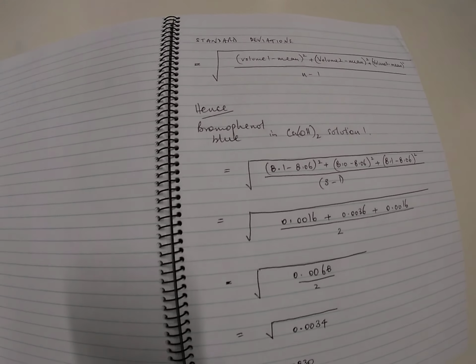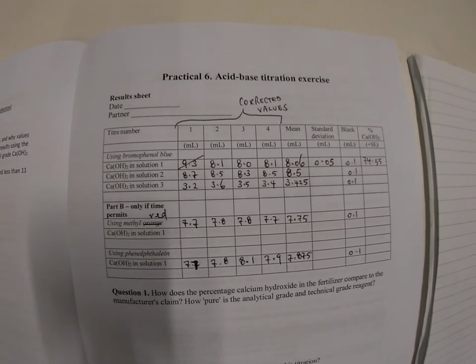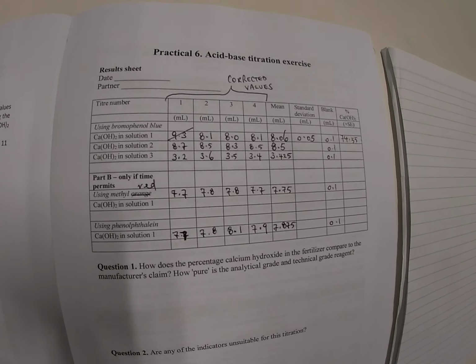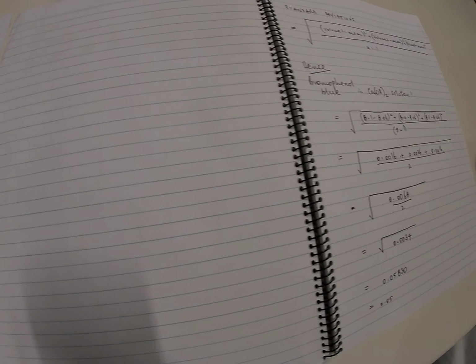So let's use the values for calcium hydroxide solution number 1, which is 8.1, 8.0 and 8.1, and the mean of those numbers is 8.06. So let's use a worked example.